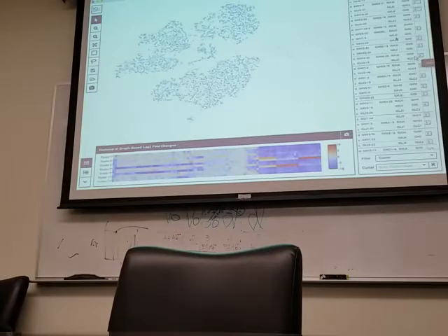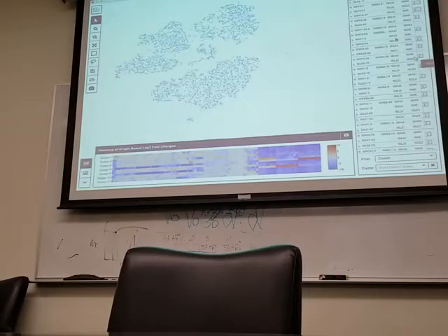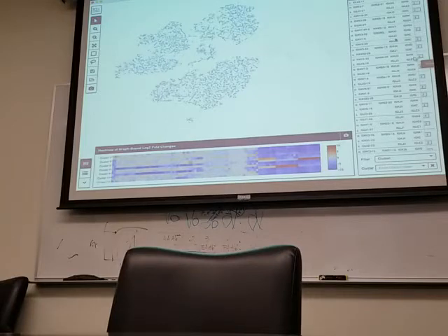So if you don't, let's see. No, I think I understand the process. The point is that if you restrict it like they did, and everything has to be absolutely identical, then there's no clonal expansion. Well, it could be if it's the exact CDR3, but because they're mutating 6 times or something like that. Right, but you're losing the information, because the CDR3 ought to be highly mutated if there's some kind of response. Yeah. But if they're naive cells, you're not going to see that.